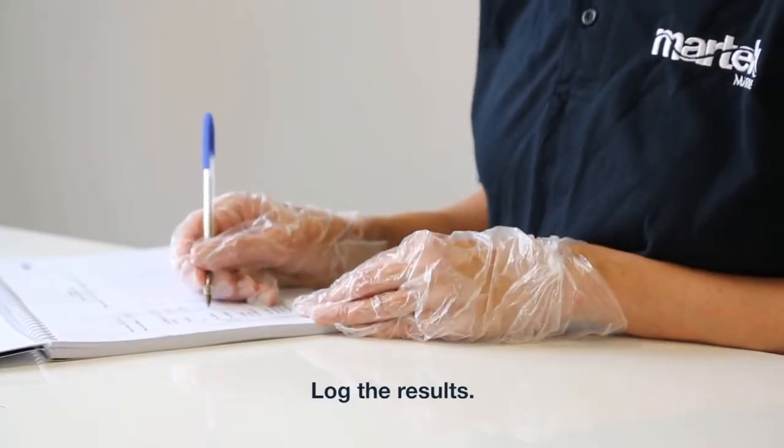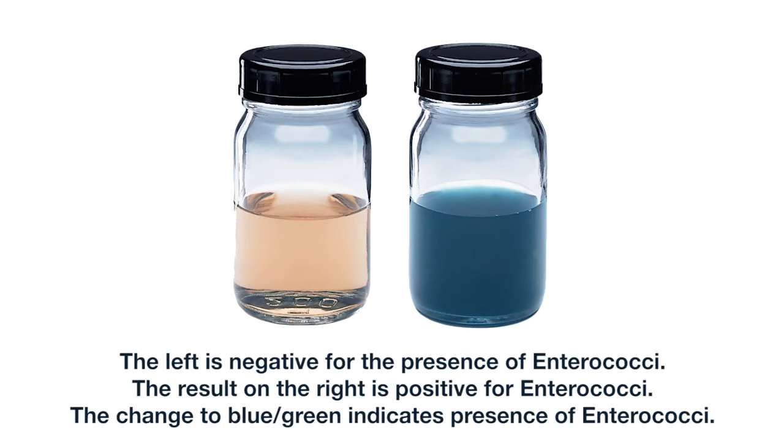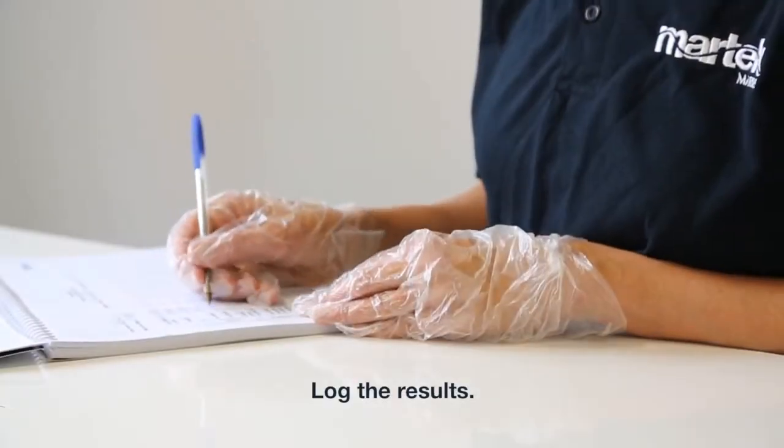Log the results. Remove the enterococci test from the incubator and check the sample for colour change. The left is negative for the presence of enterococci. The result on the right is positive for enterococci. The change to blue-green indicates presence of enterococci. Log the results.